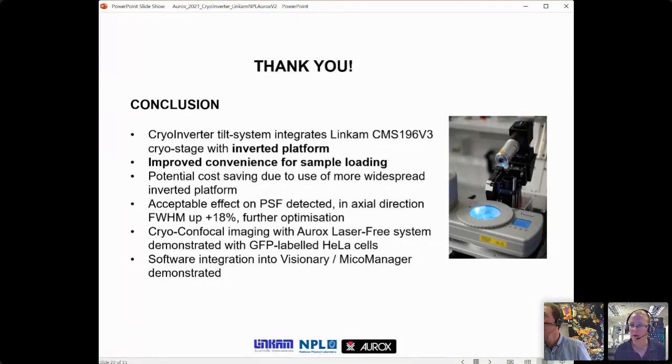So there's a couple of questions from Paul Vicada. He says, great development. Two questions. Is this already commercially available? And what about condensation on the objective when tilting the lens? Two quite different questions for you, Michael. First of all, at the moment it's a prototype, but if we hear more questions like that, we are planning to commercialize it. So yes, it will be commercial.